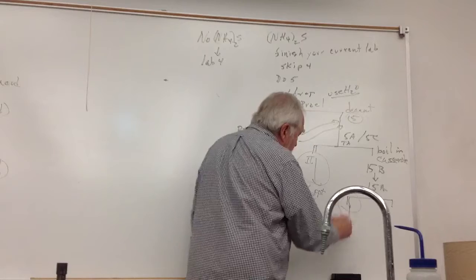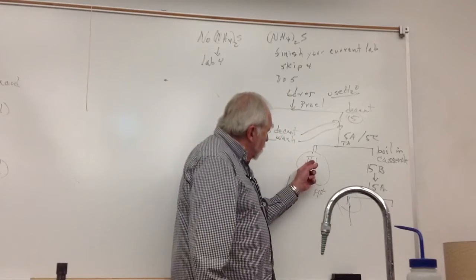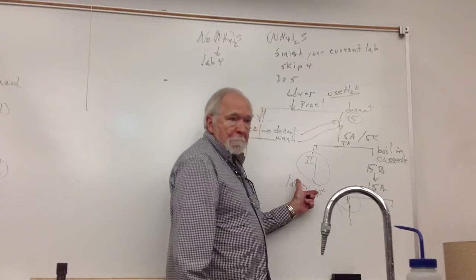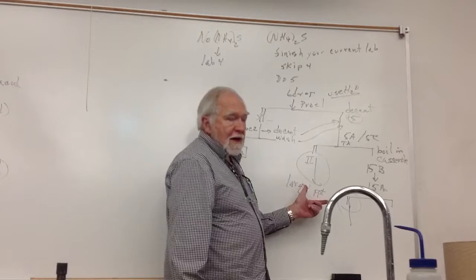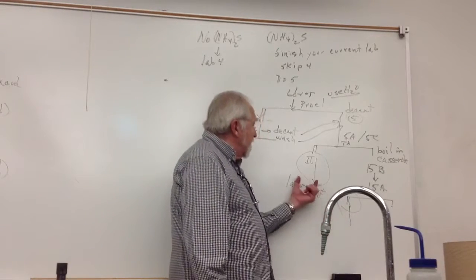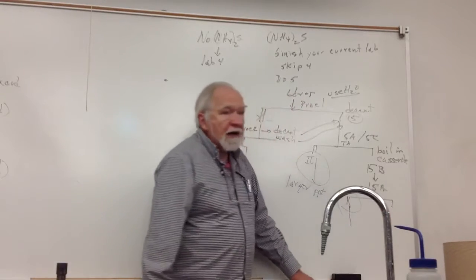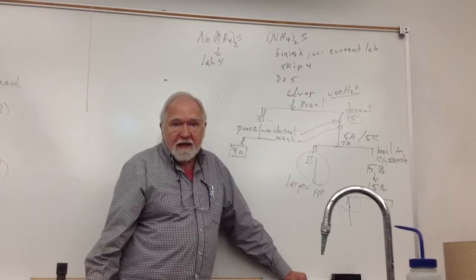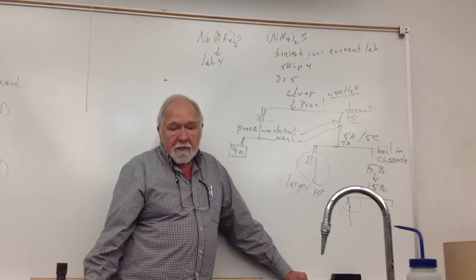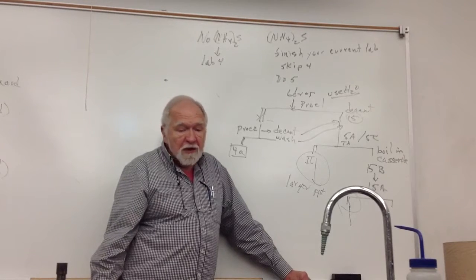Either you're going from 15 to 16 to 17 through that, or you're going from 6, 7, and 8 through this one. And then if you have time, you go to this one. Now if you don't get much precipitate here, and you don't get much precipitate here, you should quickly look at group 4, because that one's really easy. You're looking for barium, calcium, magnesium, sodium, and potassium. We're still not looking for ammonium.